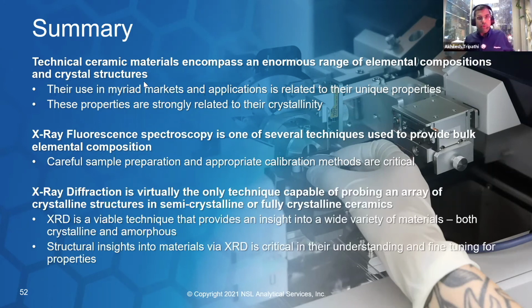Yes, so continuing with what Dave mentioned, X-ray diffraction is virtually the only technique capable of probing the crystalline structure in semi-crystalline or fully crystalline ceramics. I hope I put forward that XRD is a very viable technique that provides insight into a wide variety of materials, both crystalline and amorphous. The structural insights we saw today are critical to understanding and fine-tuning their existing properties.